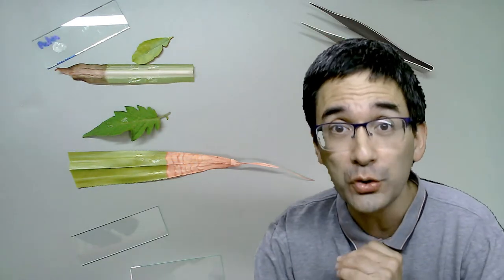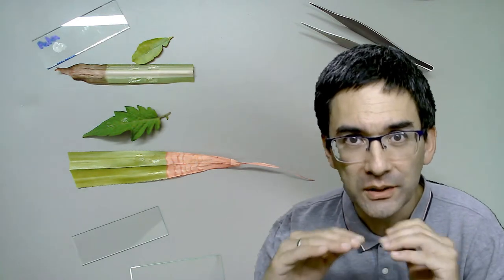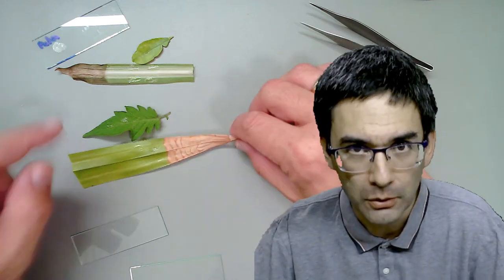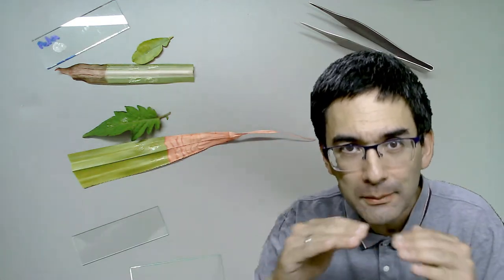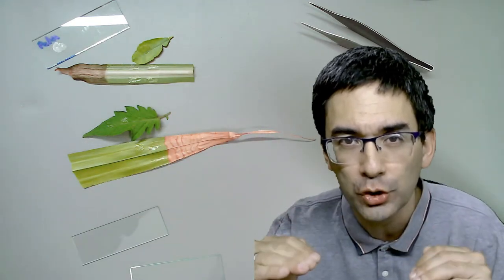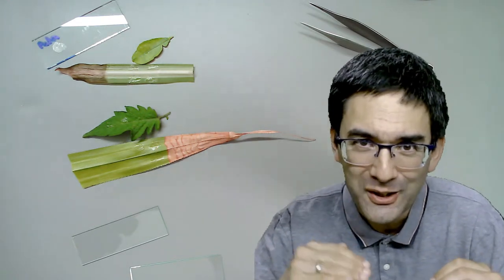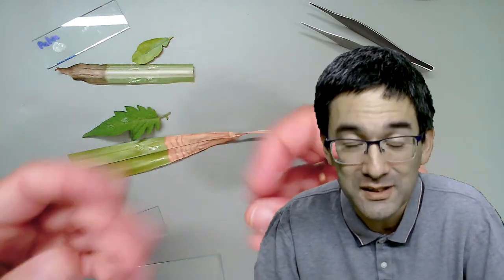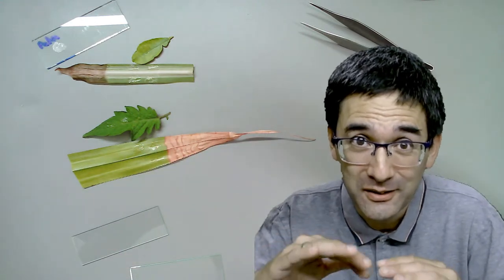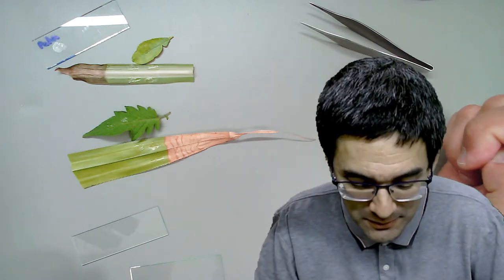Today I'd like to show you a little method - how you can make so-called leaf impressions using glue. Basically, we're going to put some glue on the leaf, then put the glue under the microscope. This way we're able to see the surface structure of the leaf, because the leaf makes an impression on the glue. It's an indirect method of seeing cells.